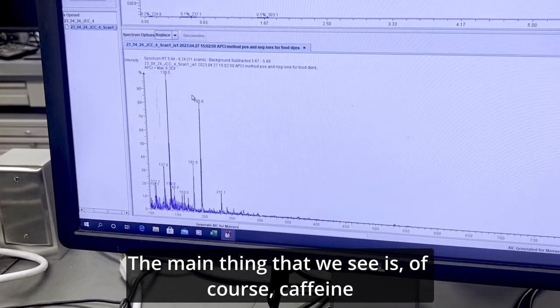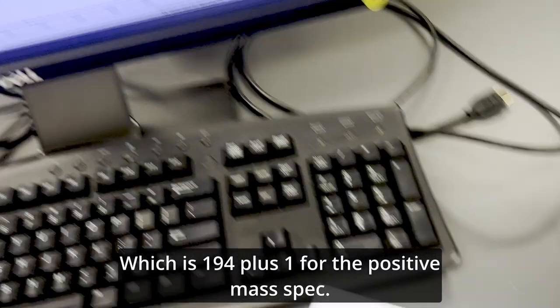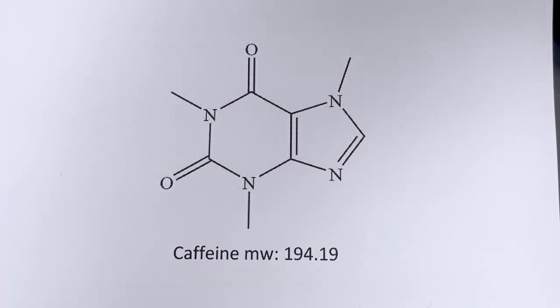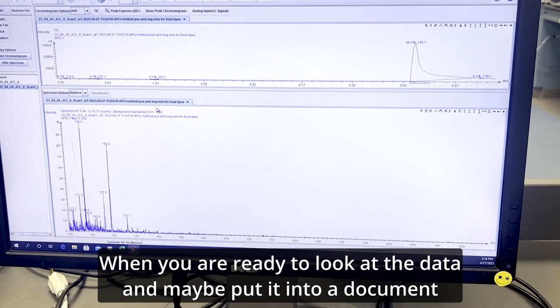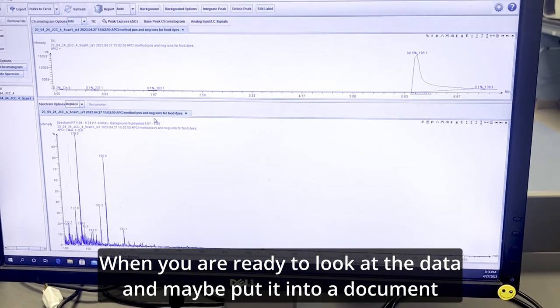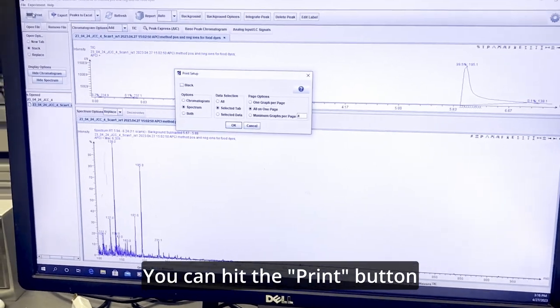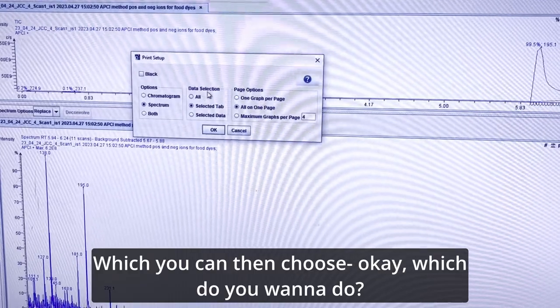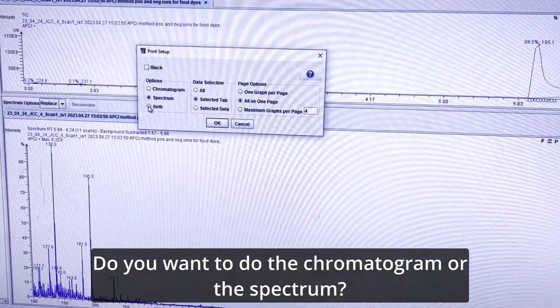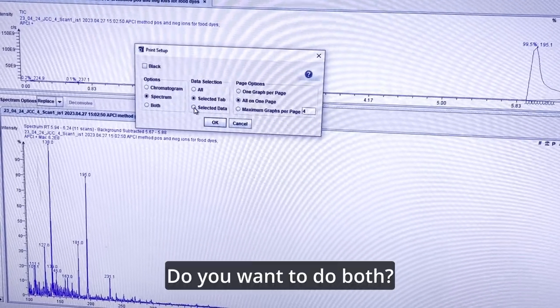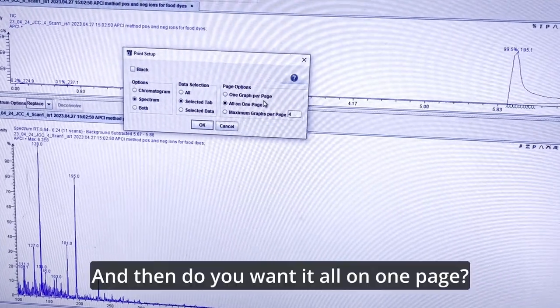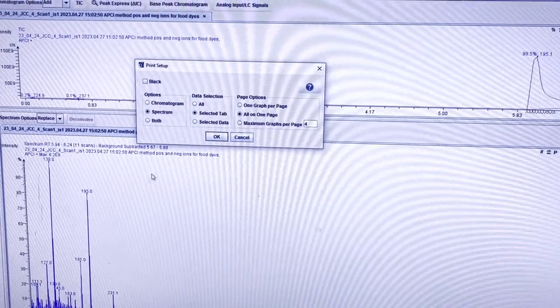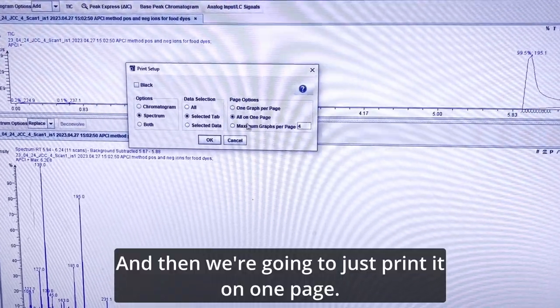So down here, we see what's in the peak. The main thing that we see is of course caffeine, which is 194 plus one for the positive mass spec. When you are ready to look at the data and maybe put it into a document, you can hit the print button, which you can then choose, okay, which do you want to do? Do you want to do your selected tab? Do you want to do the chromatogram or the spectrum? Do you want to do both? And then do you want it all on the page? So we're going to put it on the mass spectra and then we're going to just print it on one page.